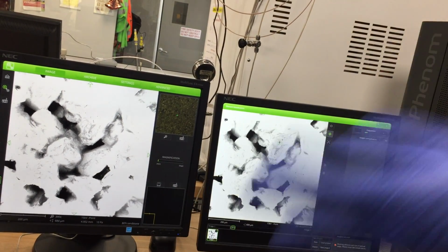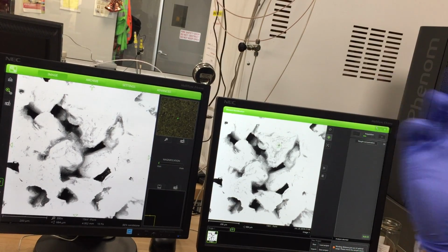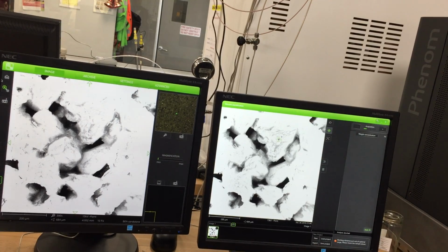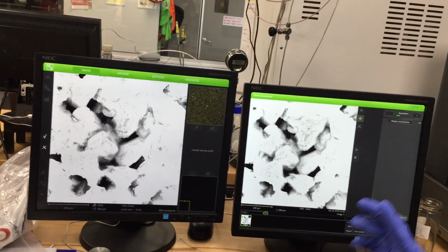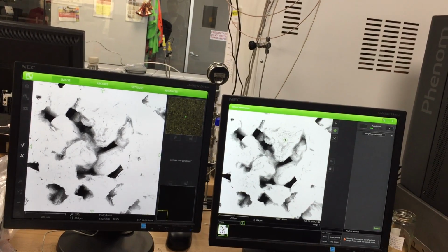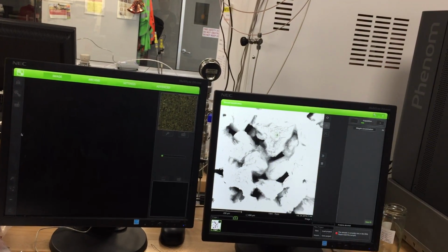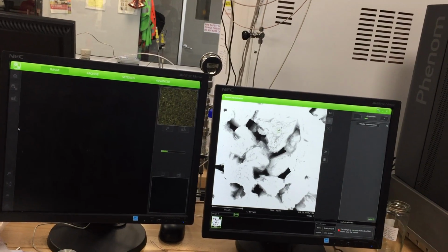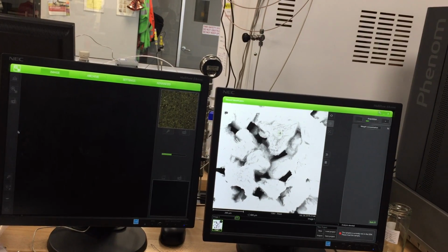I told you for imaging, you have to lower it down by 4 notches when you're turning. But for EDS analysis, you have to do it 10 to 12 notches. So we didn't lower it enough. So for EDS analysis, we have to lower it a bit further. So that's what I'm taking back up.